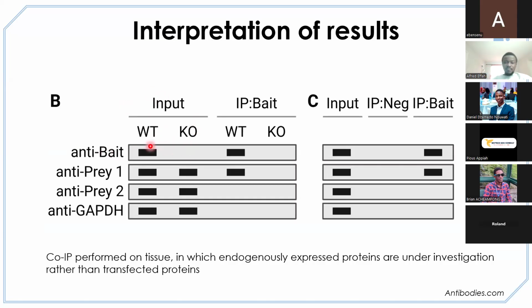You can also knock down protein, this bait, which is, let's say, protein A. We will knock it down. This is just the input. This is just the lysate. So let's say from the first, we just have the breast tissue as it is. From the second, we knock out this one. Now we perform this Western blot. We see all these proteins present. Now in the knockout, we've deleted this protein, so we shouldn't see any band. So there's nothing there.